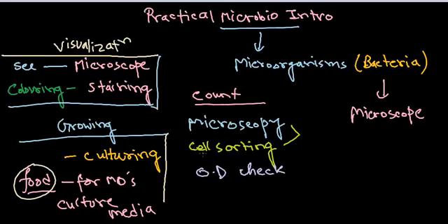Now remember, microorganisms are everywhere. Literally they are everywhere. Wherever you are looking at it, wherever you are touching, there is presence of a huge number of microorganisms, and they can grow anywhere. Literally, that's what I understand throughout the microbiology career. But the important thing is that suppose you need to grow a particular type of microorganism, it's the most important task that it should not be contaminated by other microorganisms which are undesired, because literally they are everywhere.